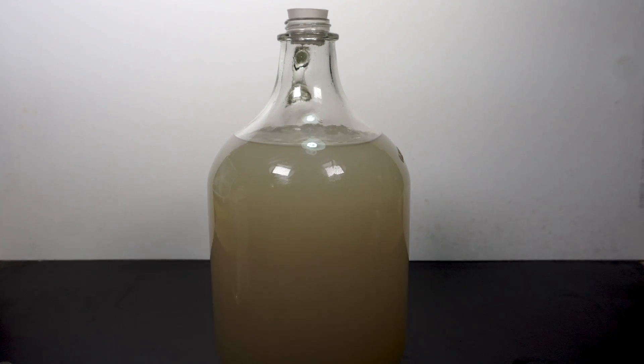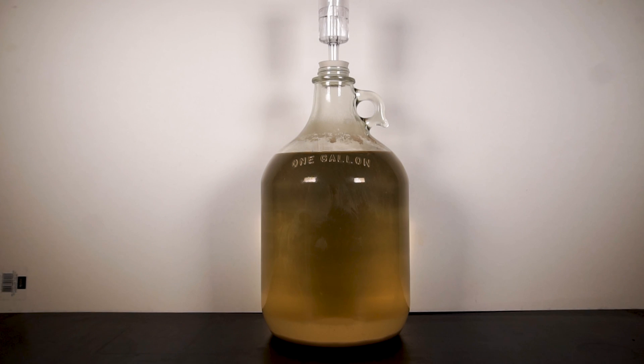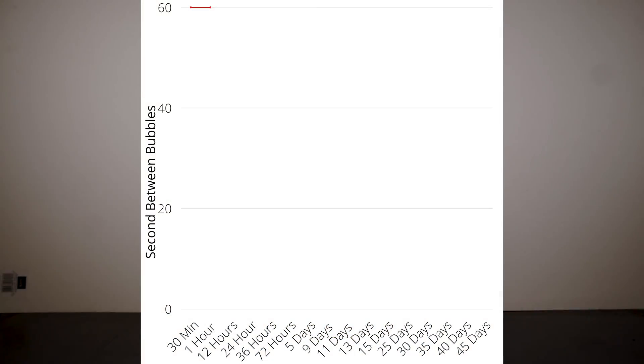After 49 days, I unwrapped the jug and it resembled champagne or beer. I was able to track the bubbling from my airlock every 24 hours to make a nice graph showing its progression. In the beginning, almost no bubbling happened at all. Then within about a day, everything picked up. Eventually, the bubbling got slower and slower until no bubbling occurs at all. As we can see on the graph, during the first few days the bubbling was at its highest. After this, bubbling continued to slow down until almost no bubbling happened even after 5 or 10 minutes.